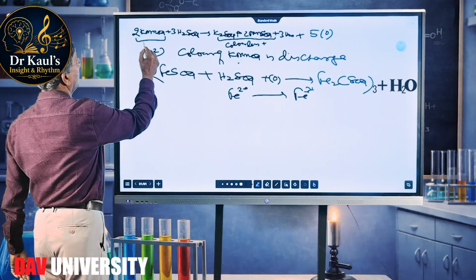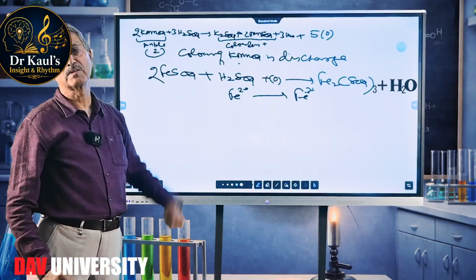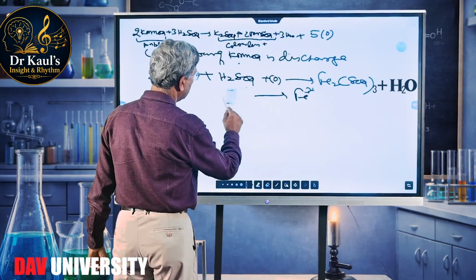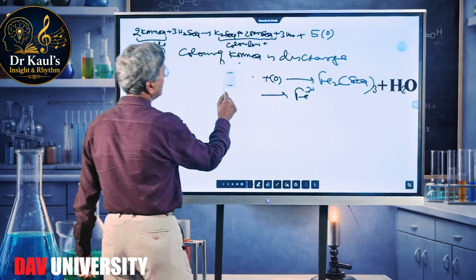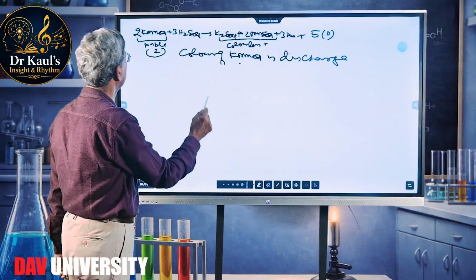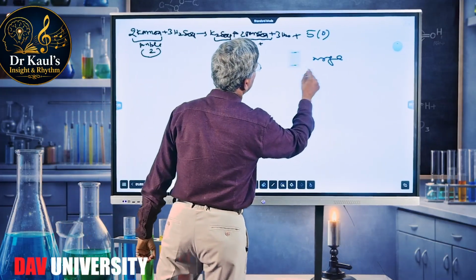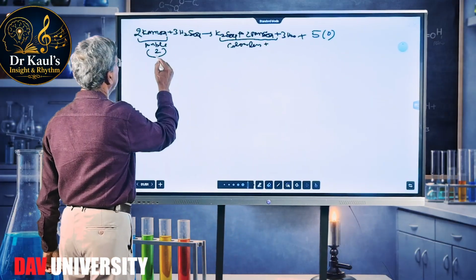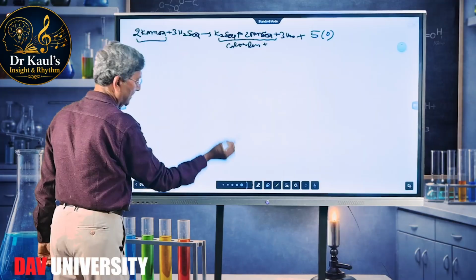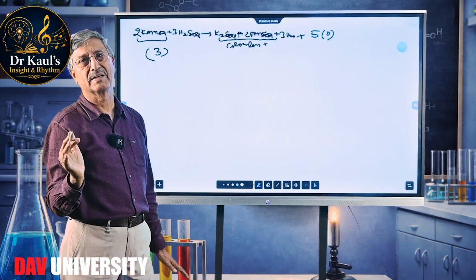and we get purple colored KMnO₄ converted into, say, colorless manganese sulfate. So in this way, tin also, if tin is present, then stannous will change into stannic and so on. So this was the second situation, that color of the KMnO₄ is discharged, but there's no evolution of any gas. And the third situation is that color of the KMnO₄ solution is not discharged.